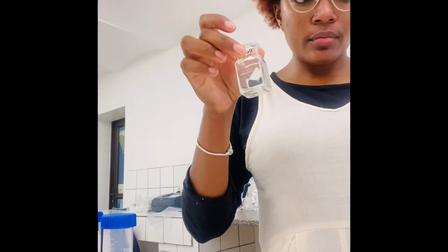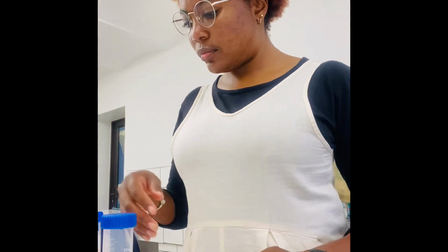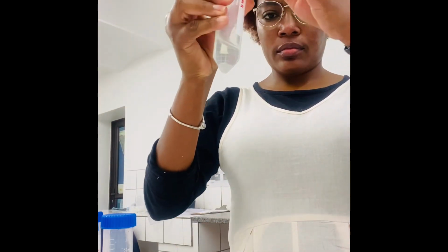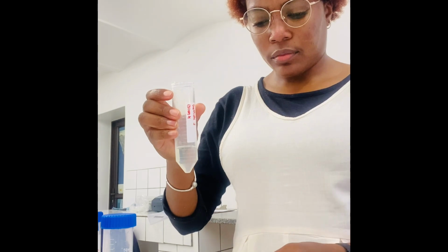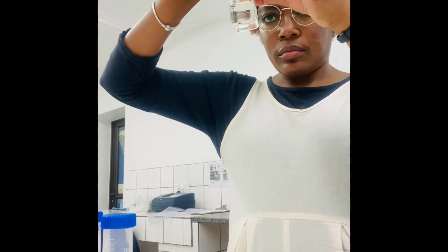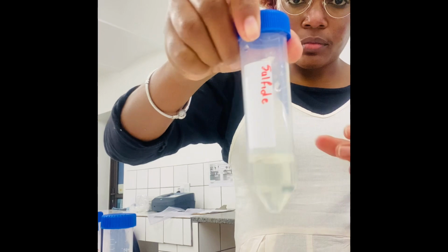And you'll see that when it's not that specific nutrient, it will give you very funny recordings. For example, if it normally just gives you a single number, maybe 0.5, 1, 0.2 and all that, and then all of a sudden it's giving you 10, then something is wrong, because some of them are very constant.